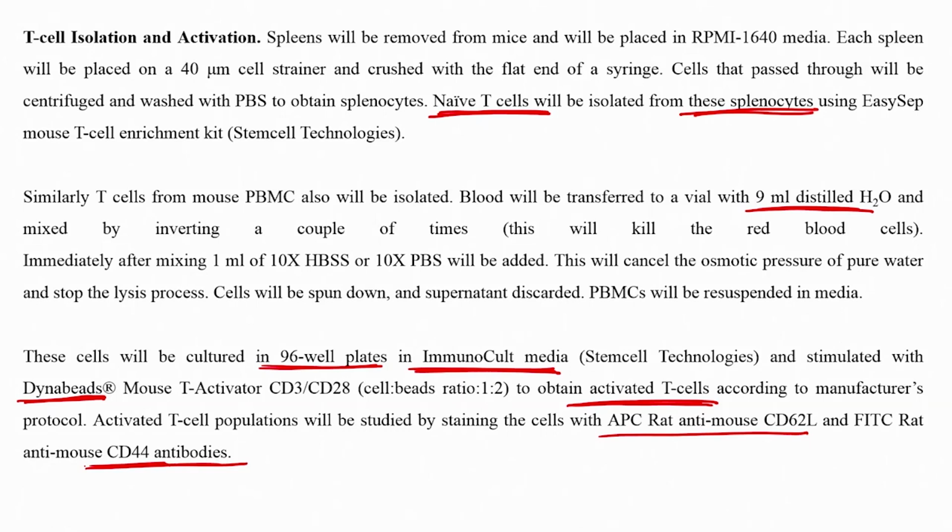So, do not get confused. This is a procedure to activate T cells. It is known by a cancer oncologist. It is an extremely easy process if you follow the protocol. We are learning this to understand what kind of device we are using and how it will be used in immunotherapy. That is why we are learning what T cells are, what T cell isolation kits are, from where we can obtain T cells, and what kinds of T cells there are.